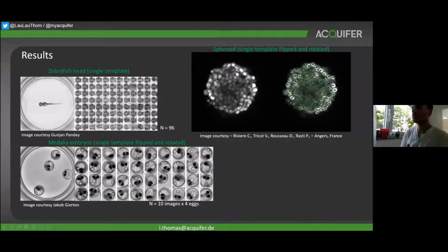And ultimately, you can even use it for cell detection, even though I tend to think intensity-based methods like segmentation would work better. It is essentially because usually for cells you want to have the outline of the cells, and with template matching you always get a rectangular region of interest.